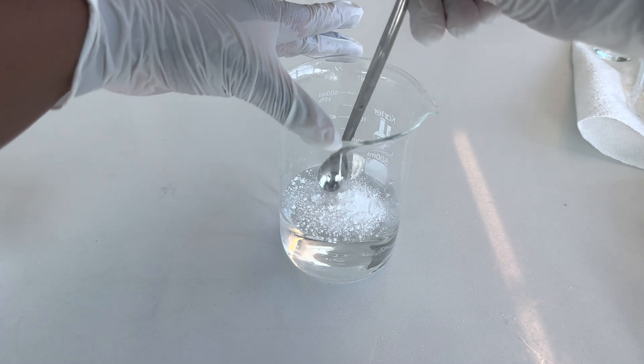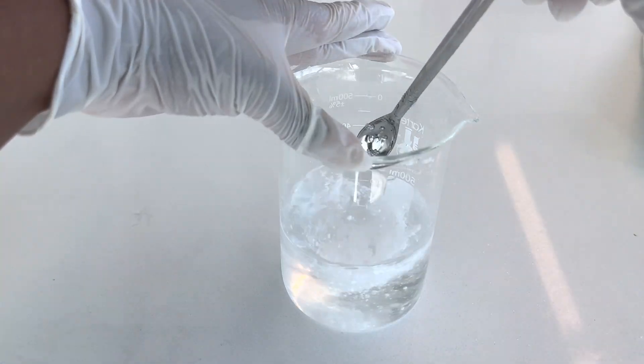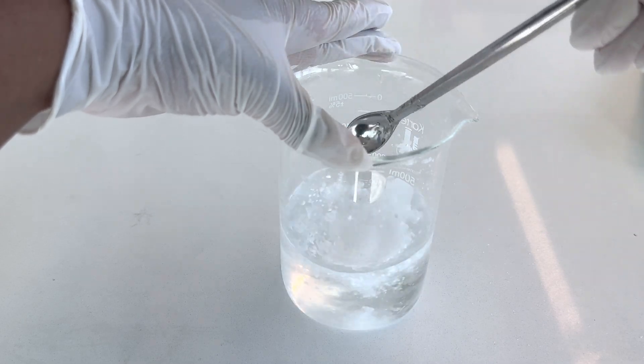Next I add in 1.2 grams of Carbomer and vigorously stir. As you can see, Carbomer does not hydrate quickly by just stirring.